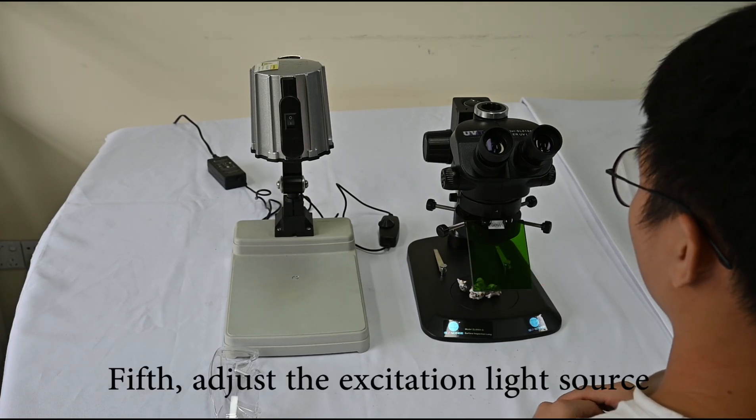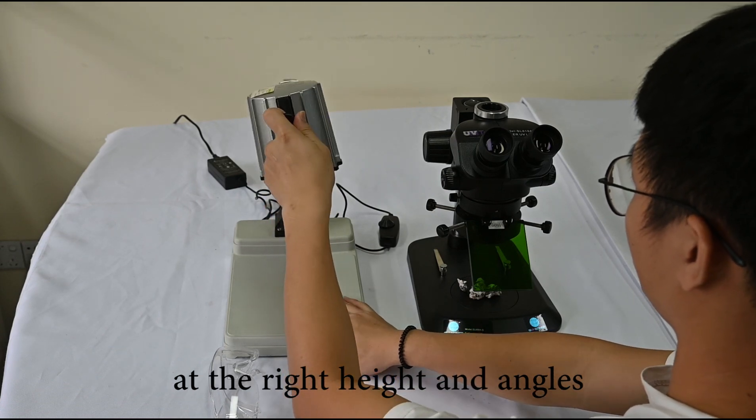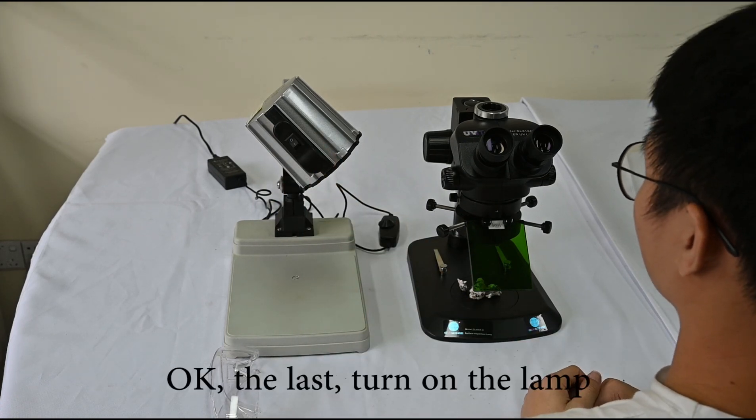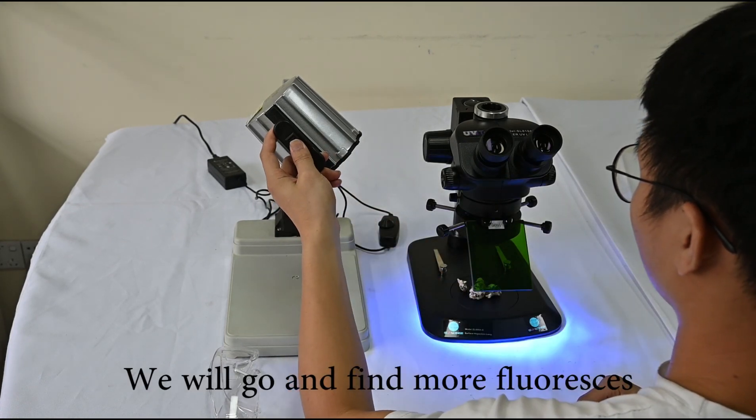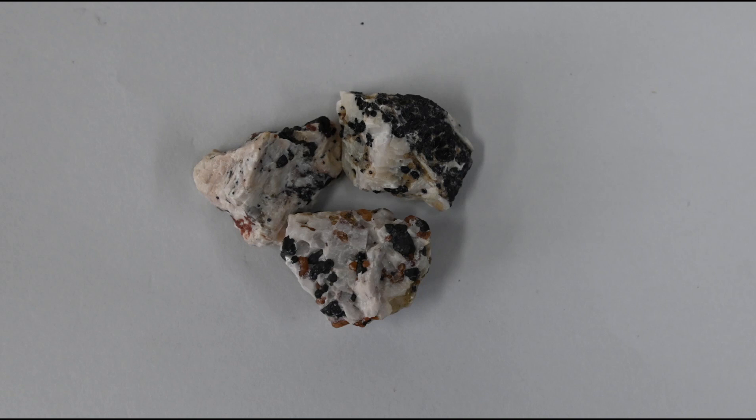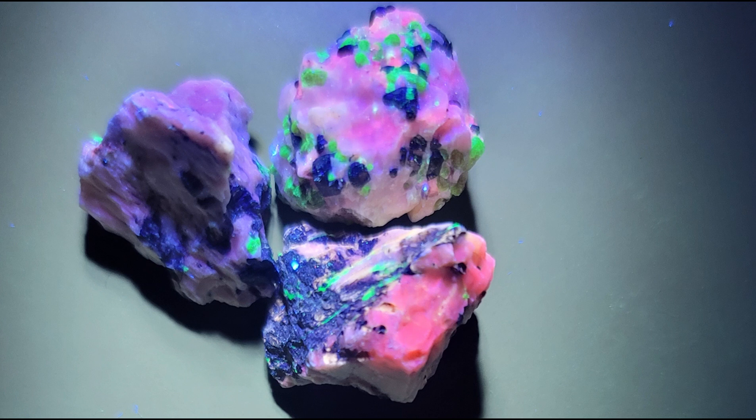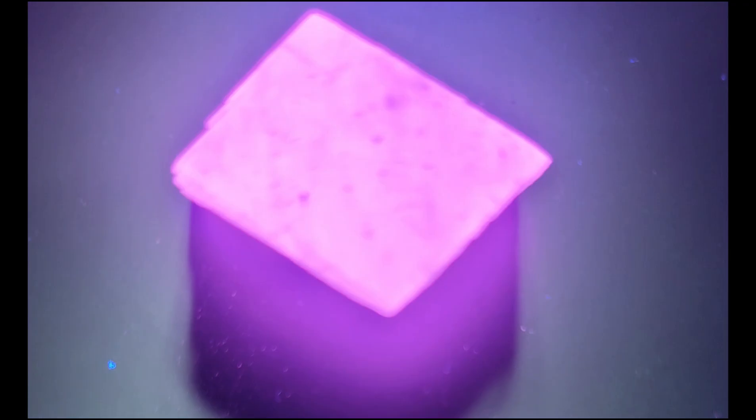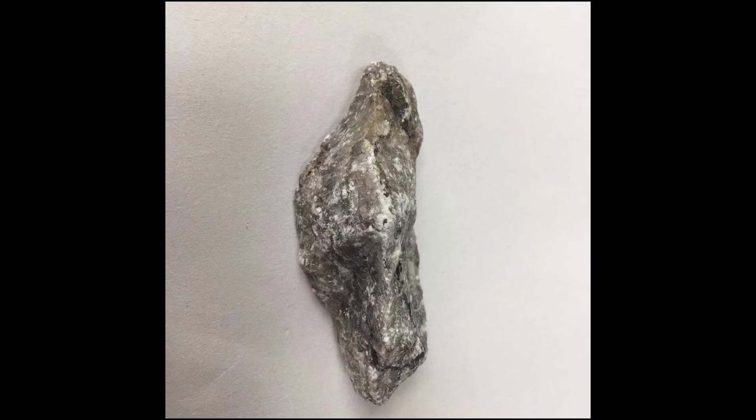Fifth, adjust the excitation light source at the right height and angles. Okay, at last, turn on the lamp. We will go and find more fluorescence.